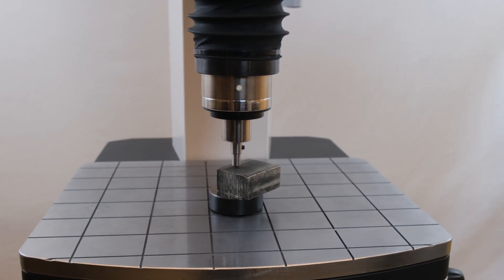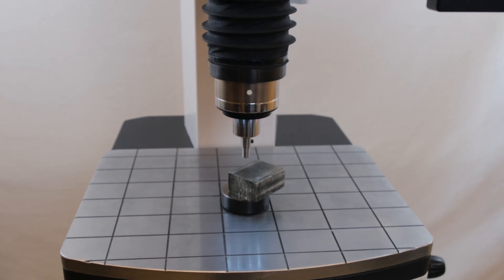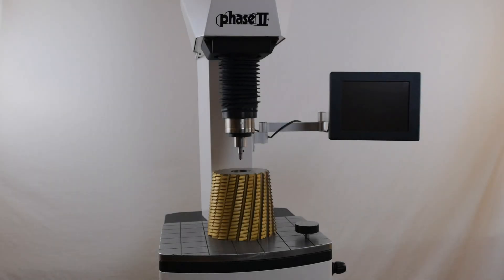Let's begin with the unique design of this series hardness tester. The maximum workpiece height is about 300 millimeters or 12 inches, and the maximum workpiece depth is about 200 millimeters or about 8 inches.